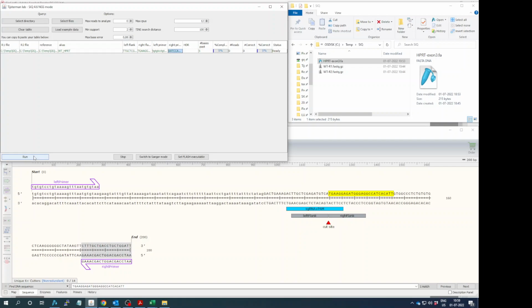So everything is done. It says here now 12 CPUs, but because it's only one file that's going to be analyzed, it's only going to use one CPU, but don't bother with changing that, it will understand that. Okay, we're going to press run, then it asks me where to actually put it. In this case, it's going to be put in downloads, and I don't care so much about the Excel file name at the moment.